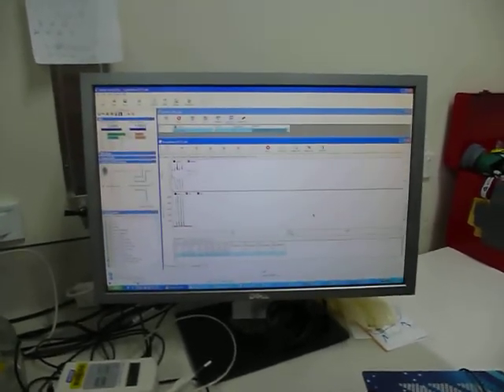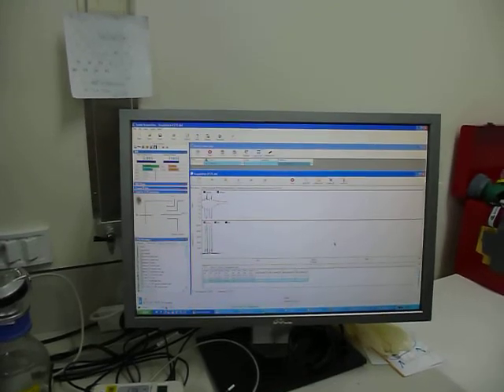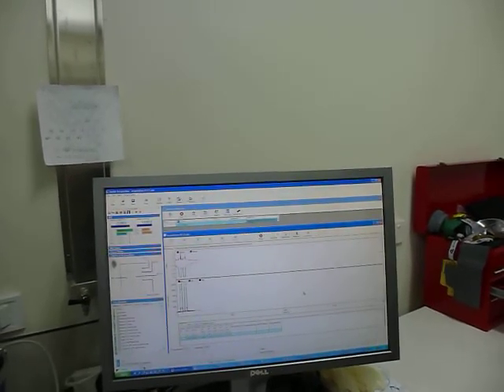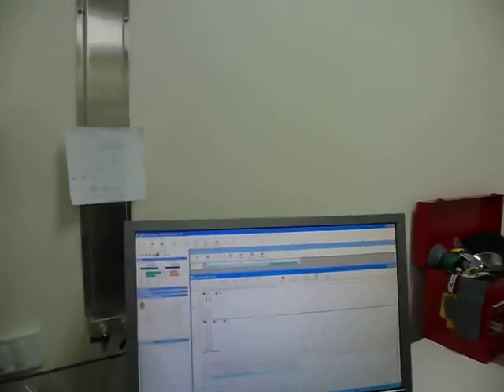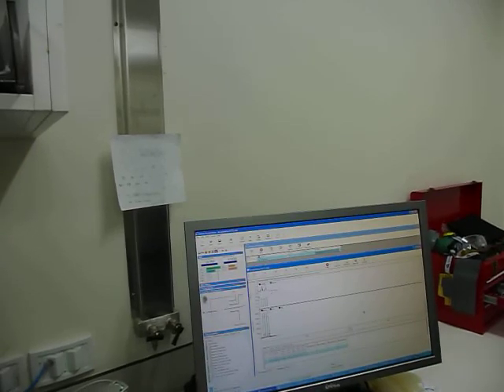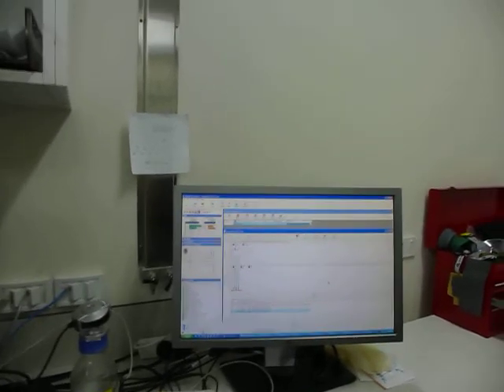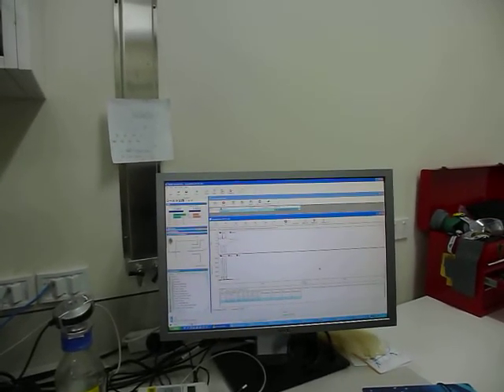The sample peak will come soon. Sorry, this is a long video, but these analyses take time. So please wait a little bit. It won't take very long, and we're going to see a peak.